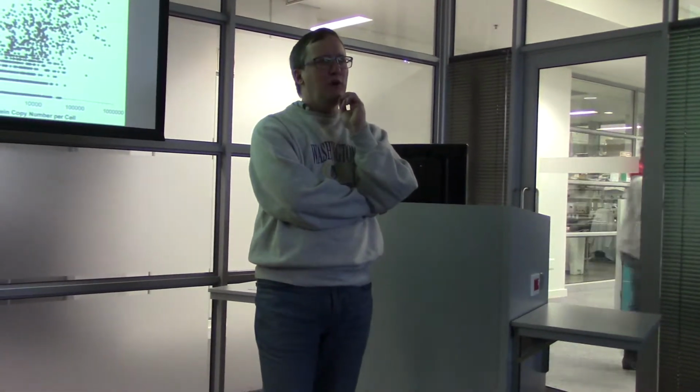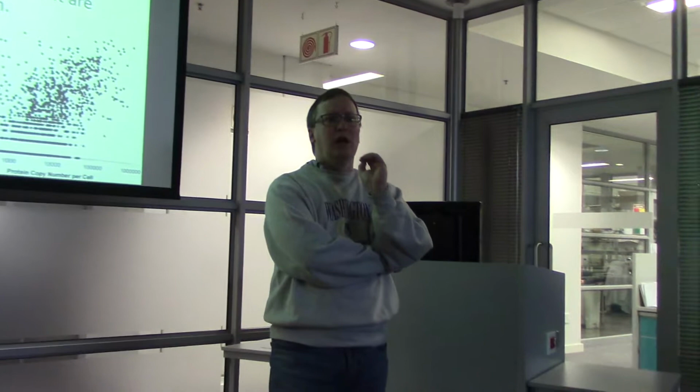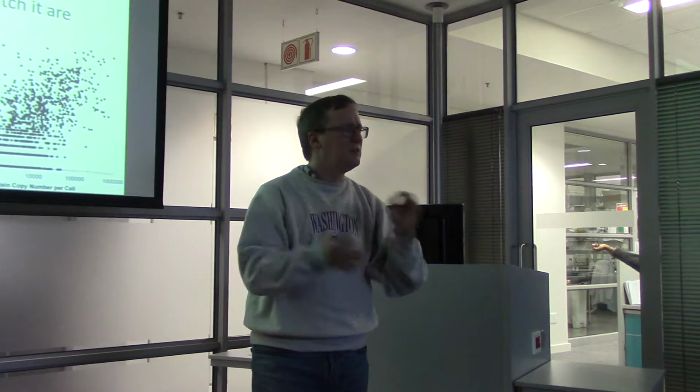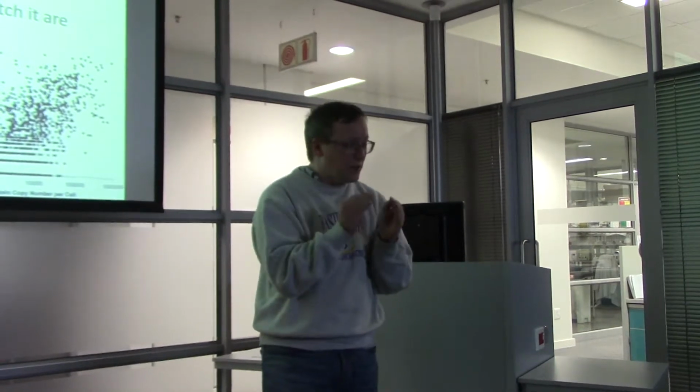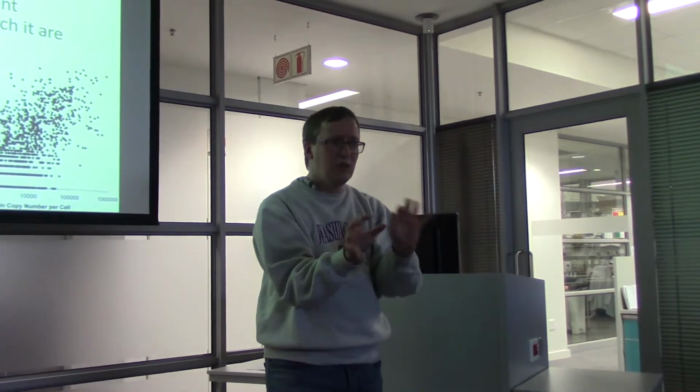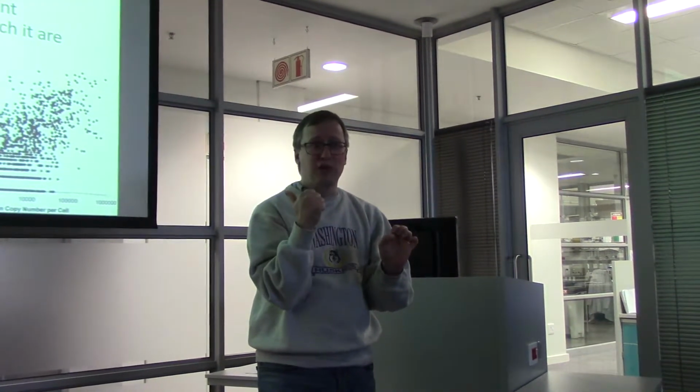So, spectral counting. This is a label-free technique intended to ask a very broad quantitative question. If your research needs to know, does this protein's level increase by 20% or by 12% between a pair of cohorts? That's a very narrow kind of question to ask. It's a very specific one, and you wouldn't want to go after something like that with spectral counting. On the other hand, if you had cohorts of this type and cohorts of that type, and you want to know which proteins change between cohorts, spectral counting is a really good option for you.